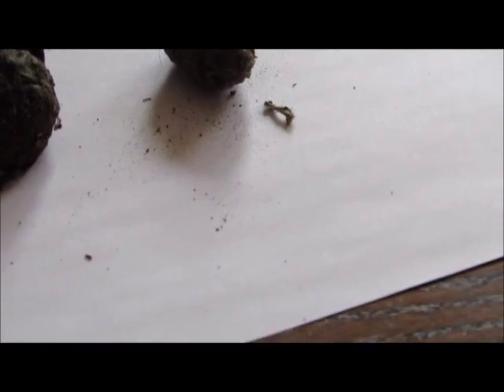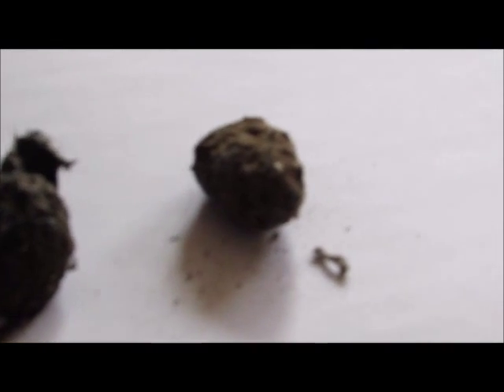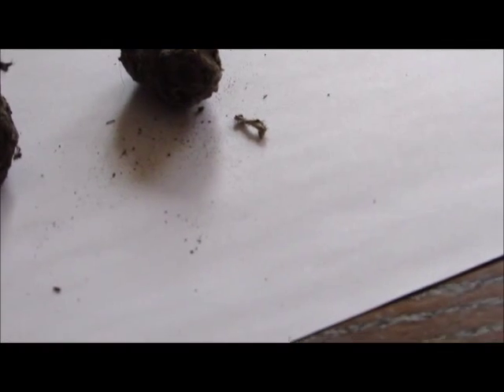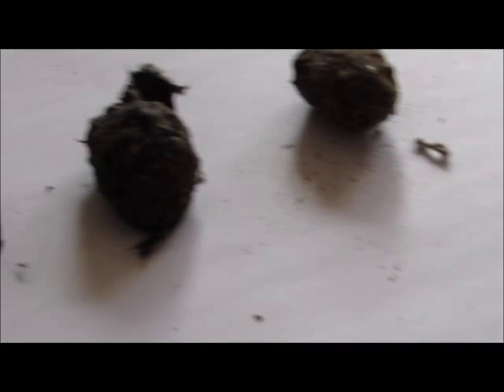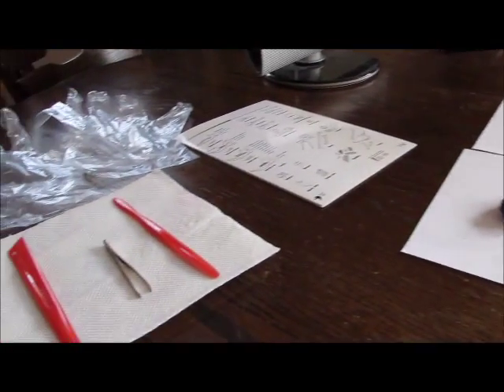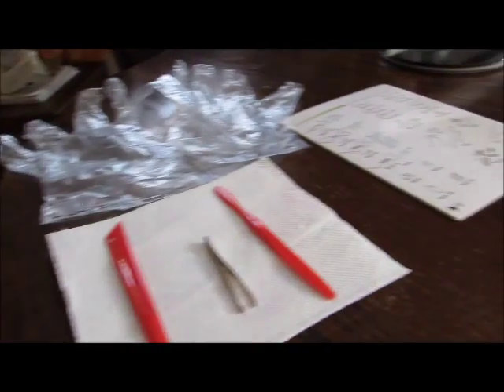I've already dissected a little bit of this one here, the one in the centre screen, and found one bone. That's only because I did a little bit of dissecting, just so I've got more to do. But I do think that these two are different to this one here. I've got a setup here for everything I'm going to need for the dissection, so let's go ahead and get started.